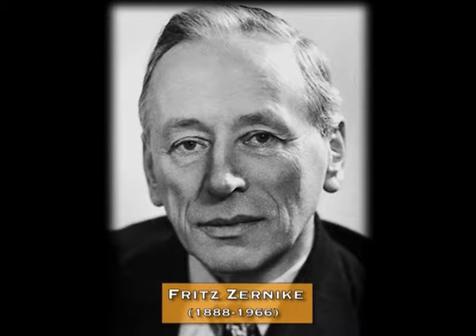Now coming to phase contrast microscope, as the name tells, we want a change in phase of light to enhance the contrast. The optics of it was first devised in the 1930s by Fritz Zernike, who suggested that if light passes through an object, depending on the thickness of the object, there can be a change in the phase of the light compared to light which is passing through the background. This is amplified by a few optical elements in the instrument and is reflected as a difference in intensities of light, which our eye can detect as a change in contrast.